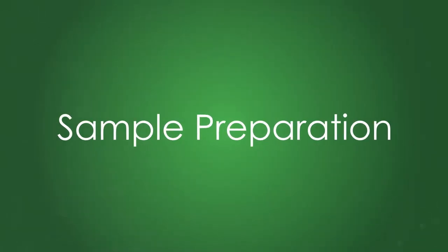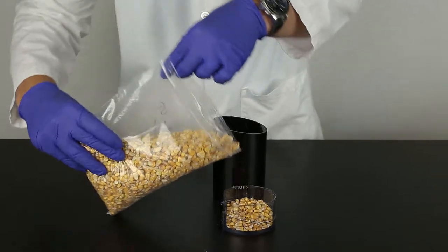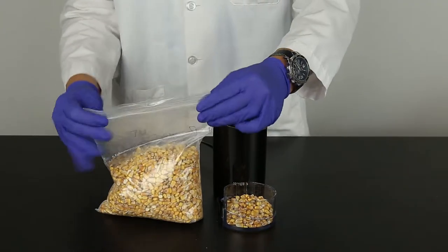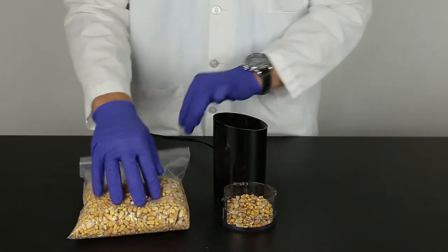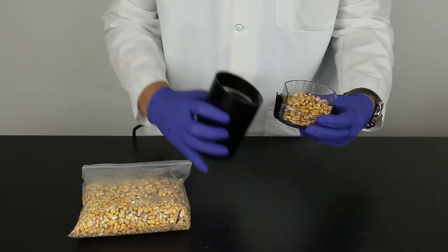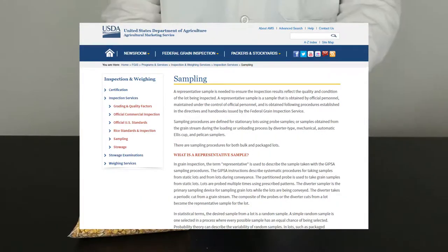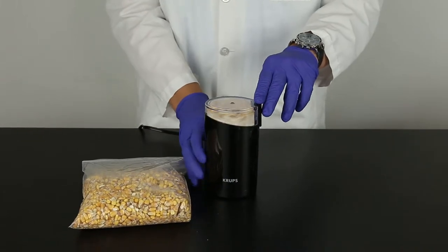To prepare the sample, begin by gathering all the materials required. The sample to be tested should be collected according to accepted sampling techniques. See the FGIS sampling protocol or contact your Neogen representative.